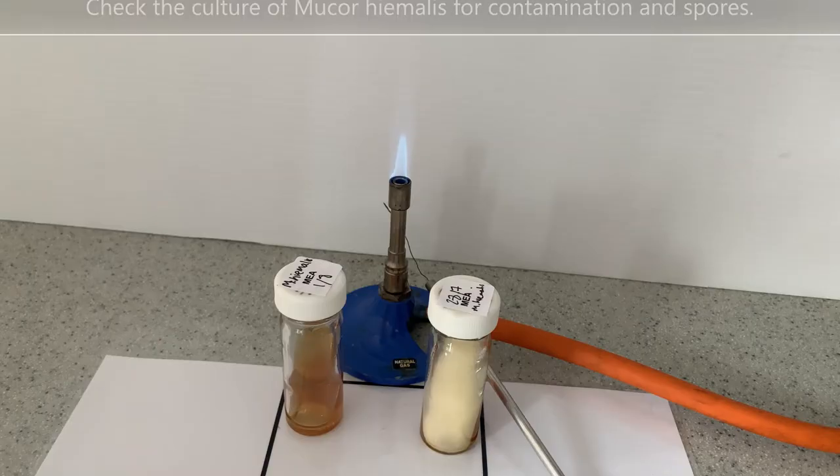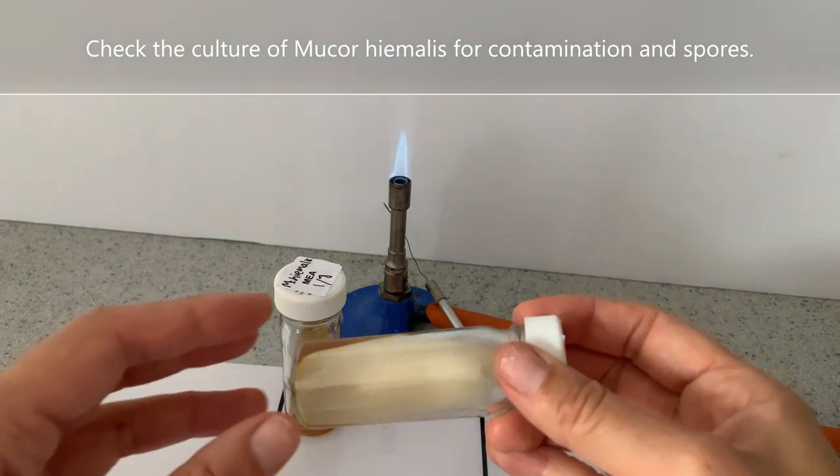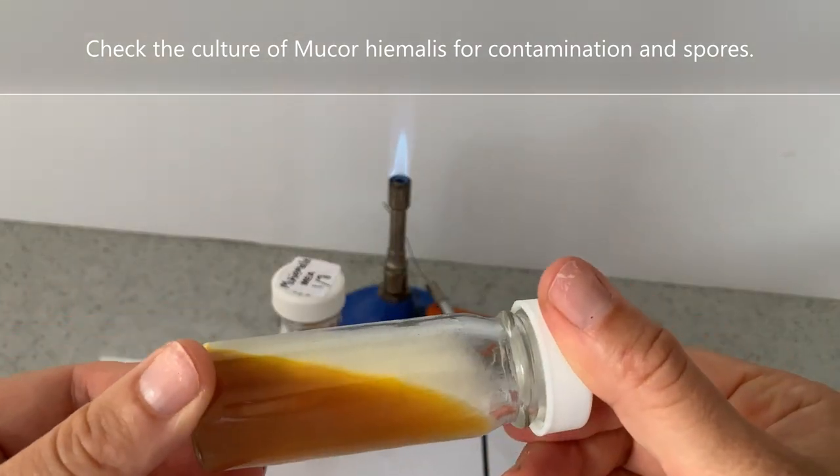Subculturing Mucor hiemalis. Check the culture of Mucor hiemalis for contamination and spores.